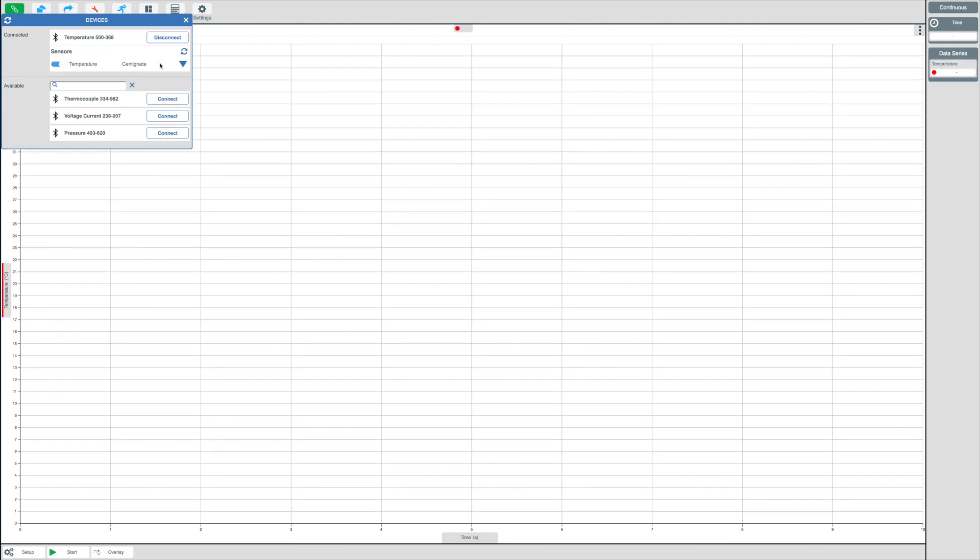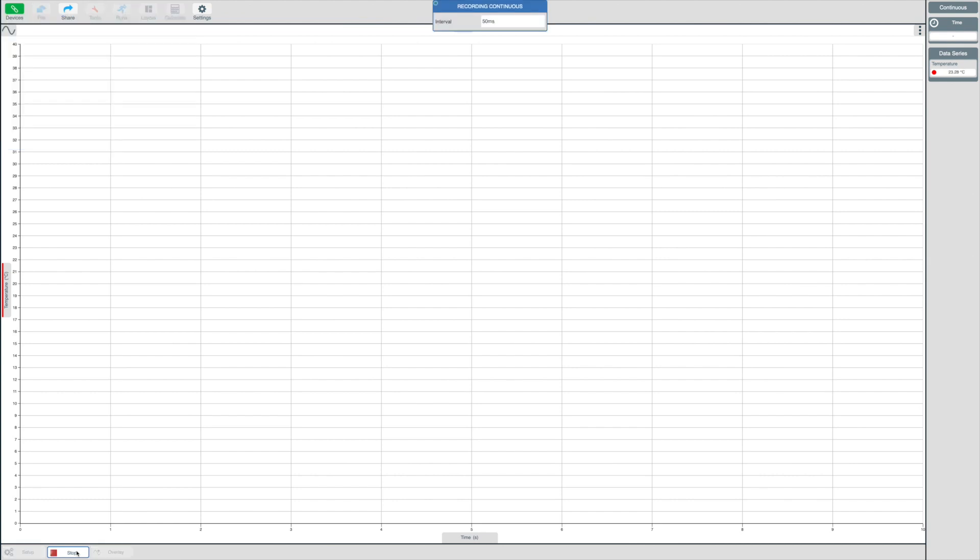Once connected, all you now need to do is click the start button to begin your experiment. The devices panel will close automatically. The EasySense 2 software is now recording data. To stop recording, simply press the stop button. And that's it.